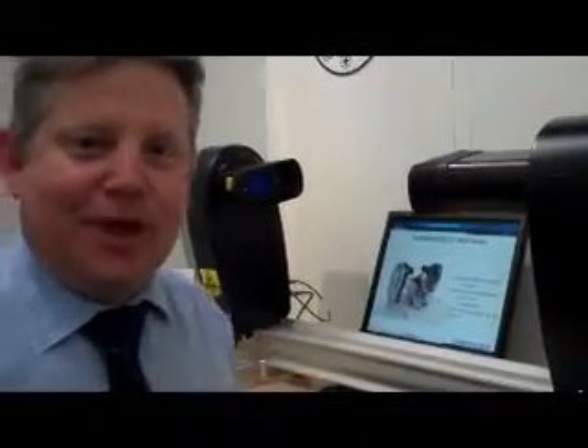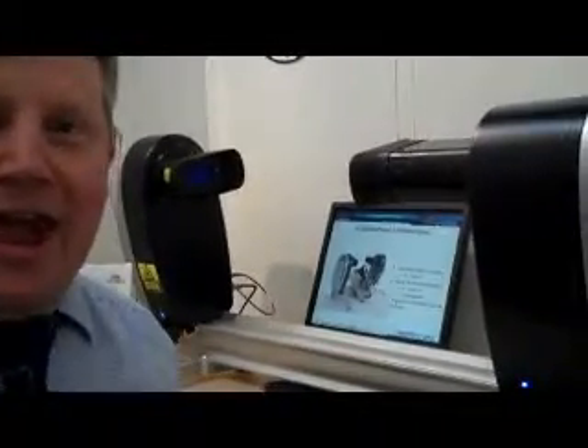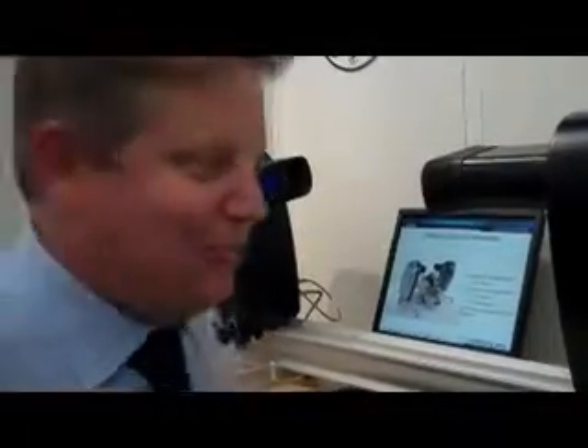Welcome to the Malvern Stand. This is the Malvern Spray Tech System, which is our laser diffraction product for measuring sprays. It comes in a size range from 0.1 to 2,000 microns, and it's in an open bench format, so we can work with different aerosol and spray products and measure them quite easily without disrupting the spray plume.